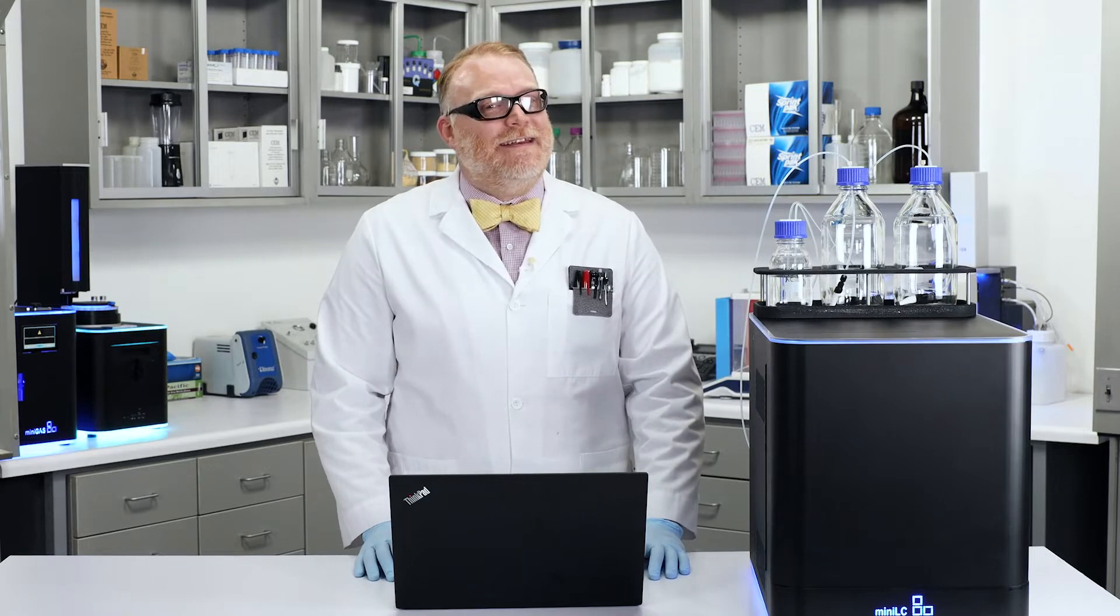It looks as if the Mini-LC is done. Let's take a hit into that data. Now that we're in the data, let's show you three chromatograms of 50 parts per million overlaid on top of each other.